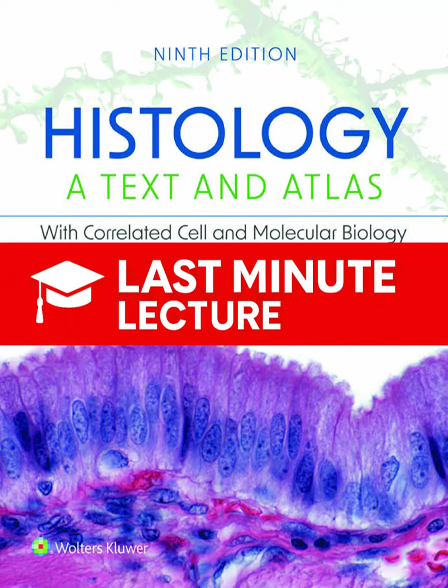Okay, now we make the final jump in resolution, moving to electron microscopy, which offers another 1,000-fold increase in resolution over light microscopy by using beams of electrons instead of light. The Transmission Electron Microscope, or TEM, uses a beam of electrons focused by electromagnetic lenses. The electron beam has this incredibly tiny wavelength, about 1/2000th that of light, which gives it a theoretical resolution of 0.05 nanometers. The prep for TEM must be way more rigorous than for light microscopy, given that level of resolution.